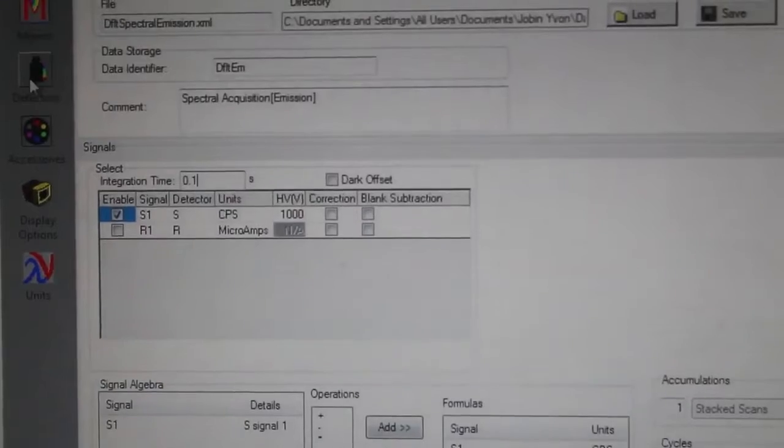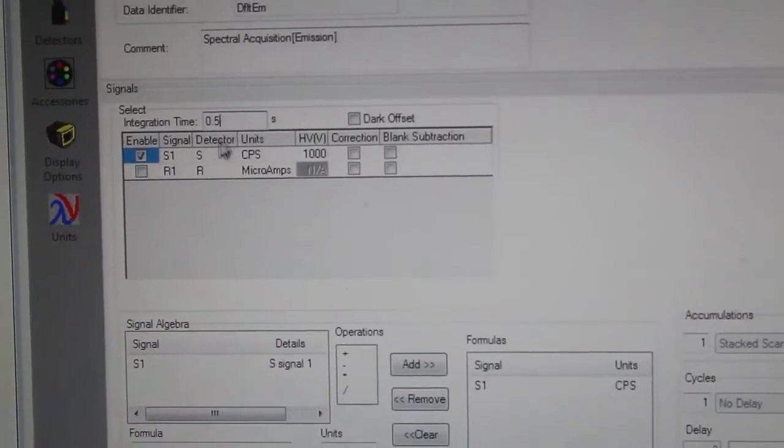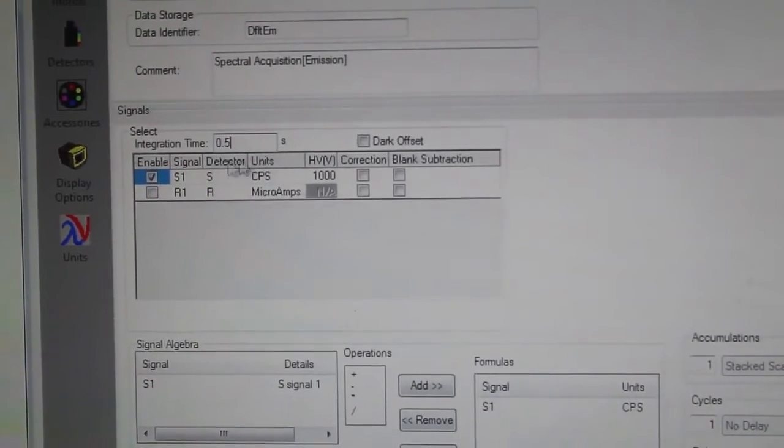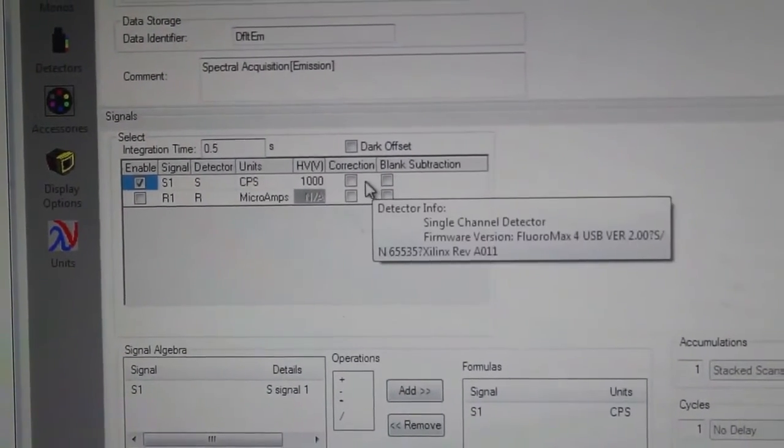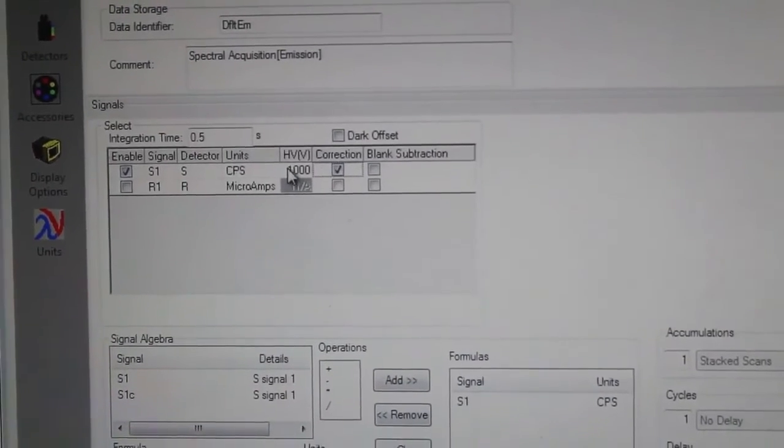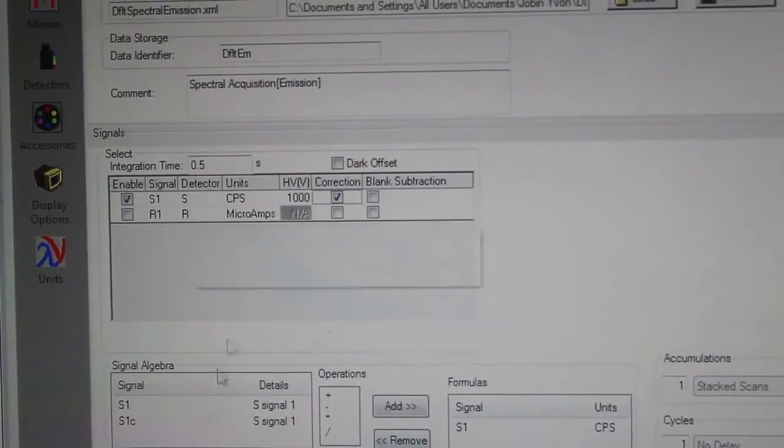Then we go to the detector window and change the integration time to 0.5 seconds. This means at every wavelength it will wait for 0.5 seconds to collect the fluorescence emission. Then we click on this correction window because this will deduct the excitation profile of the light from the emission window.